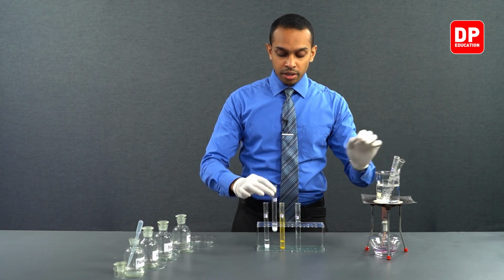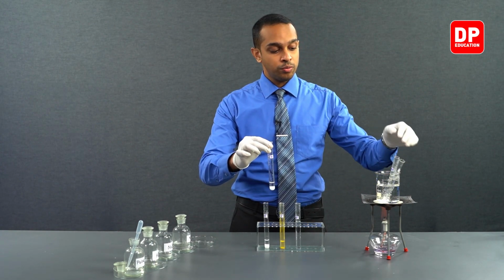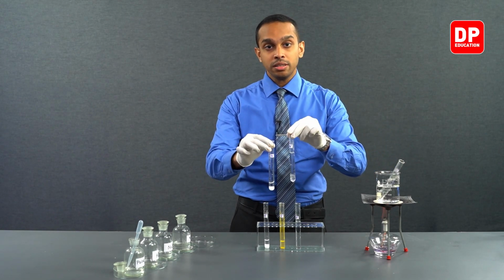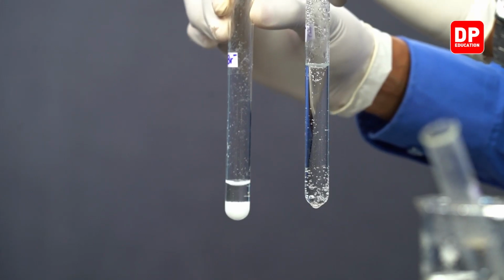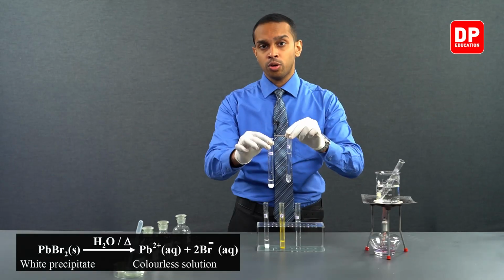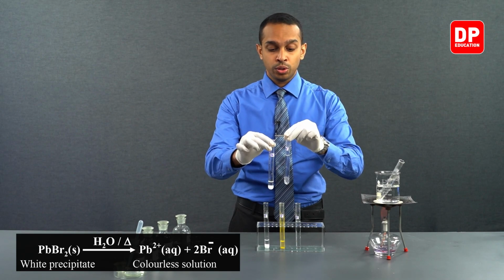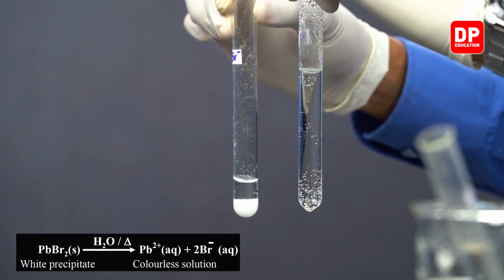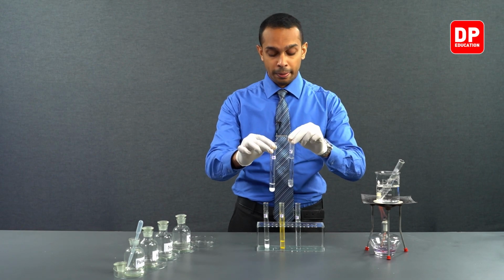Then we took a little bit of lead bromide, added a little bit of water, and heated it for a while. If you take a look at the results, you can see the lead bromide precipitate completely dissolved in hot water, and upon dissolving it formed a clear solution. So this observation is evidence that lead bromide is soluble in hot water.